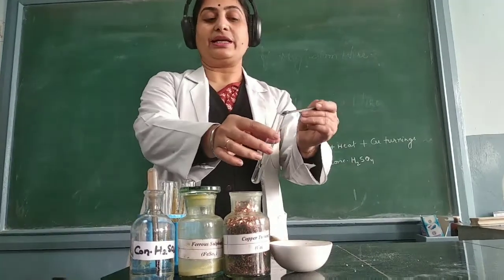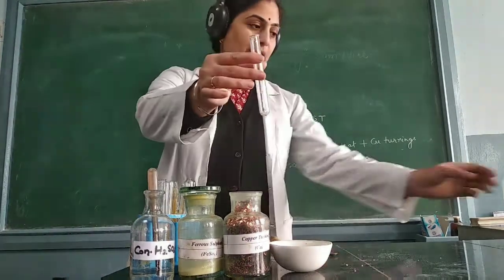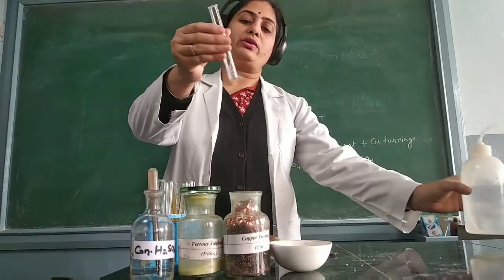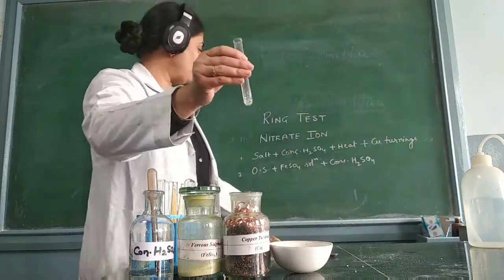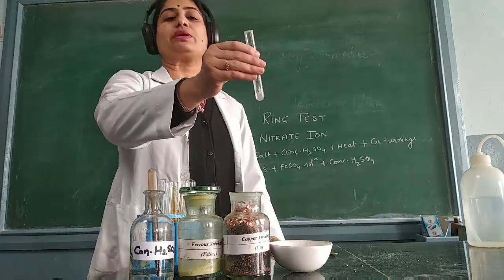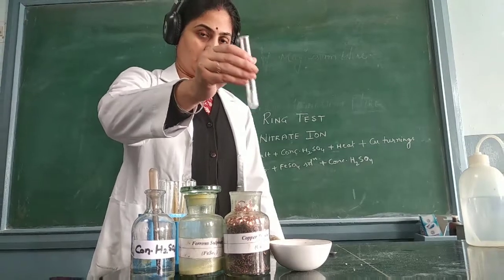For the confirmatory test, I take a small amount of the salt and then add some water to it. On adding water we get the original solution — we call it OAS or original aqueous solution. I get a clear and transparent solution on mixing this salt and water.